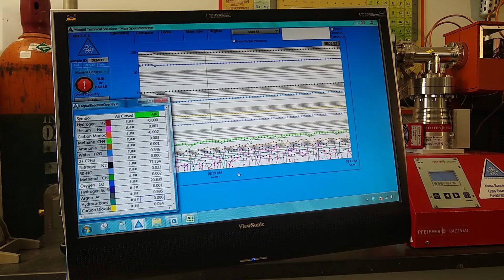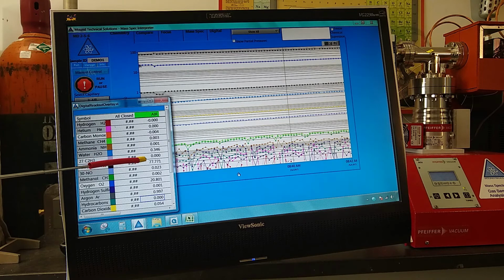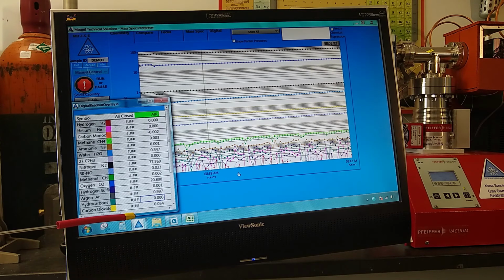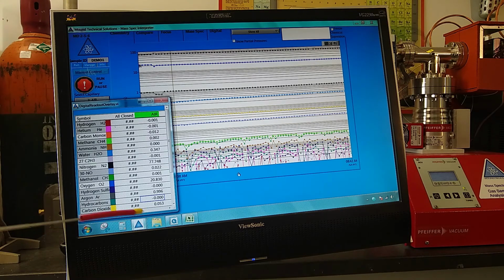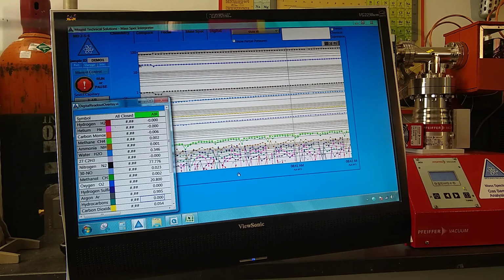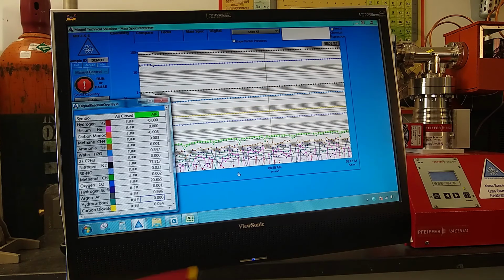In fact, the number that you're seeing here is a percentage. So while we have 78 and 21% on some components, such as nitrogen and oxygen, you'll see some very small numbers, such as the carbon dioxide, this yellow plot. On our logarithmic scale, we're showing this logarithmically so that we can present all 5 decades of information reporting here.